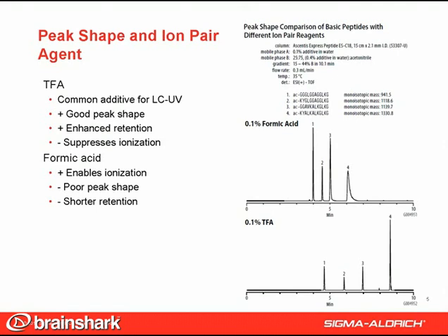TFA at levels typical for UV-based peptide mapping, 0.1%, causes severe reduction in MS sensitivity. So acetic acid and formic acid have been used as alternatives to TFA for LC-MS of peptides, but formic acid has become more common. However, users have noticed that peak efficiency and peak shape in the presence of 0.1% formic acid are not as good as with 0.1% TFA. This is particularly evident with basic peptides as shown in this figure.